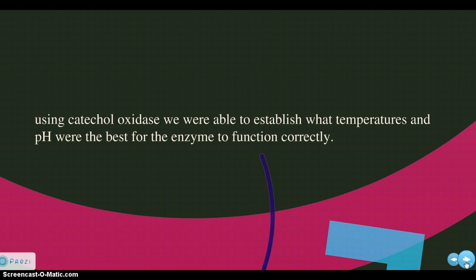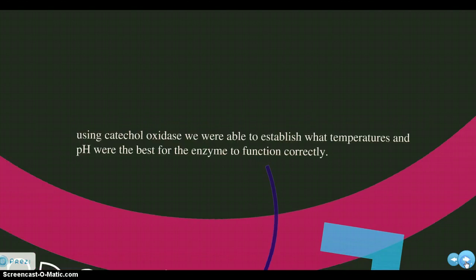it's that enzyme in our fruits that turns them that delicious brown color that makes the fruit so appetizing to eat afterwards. I'm joking. But yes, when this enzyme comes in contact with air, once the skin of the fruit is peeled off, it turns brown because it has an end product with that color. So that is the enzyme we're using today. Sorry, I got a little lengthy there.